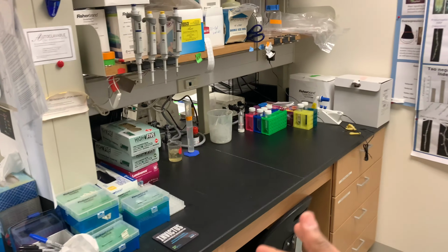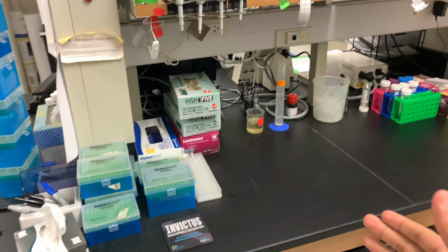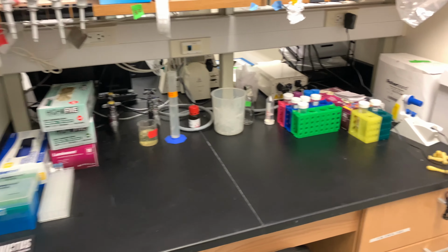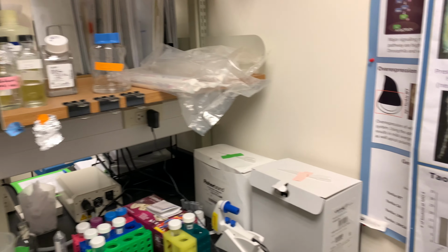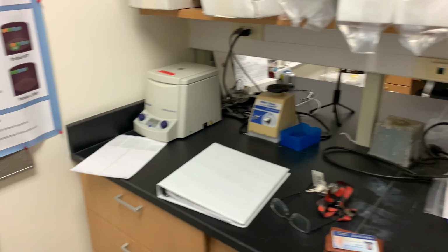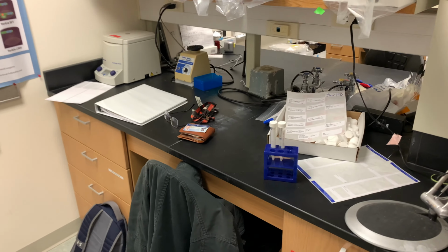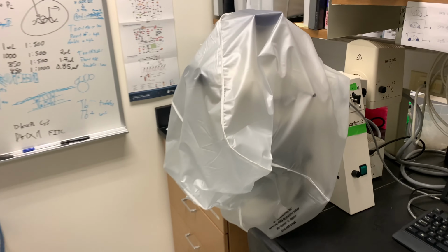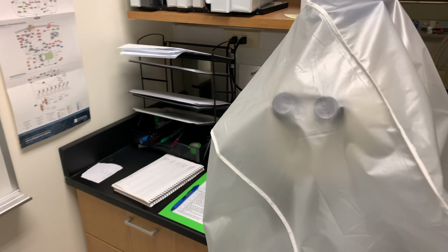This is our workstation where we prepare our experiments and do different washings. You'll be able to see some of that later. This is another general work area where we keep our stuff. If we need to do any writing, we do it over here. And over here is our immunofluorescence microscope.